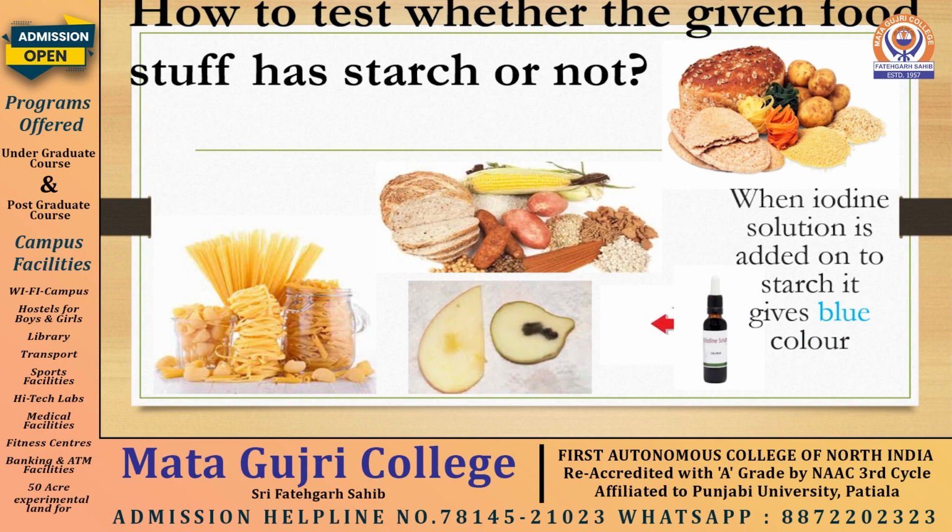How can we test whether the given foodstuff has starch or not? This experiment can be performed at home if you have iodine solution with you. Simply take a slice of potato and add few drops of iodine solution to it. You would see soon it turns blue in color. This simply shows that your potato is rich in starch.